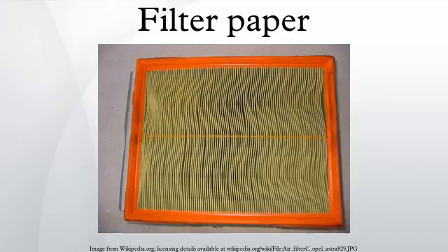There are two mechanisms of filtration with paper: volume and surface. By volume filtration, the particles are caught in the bulk of the filter paper. By surface filtration, the particles are caught on the paper surface. Filter paper is mostly used because even a small piece of filter paper will absorb a significant volume of liquid.